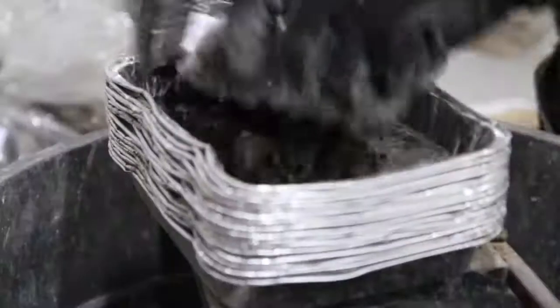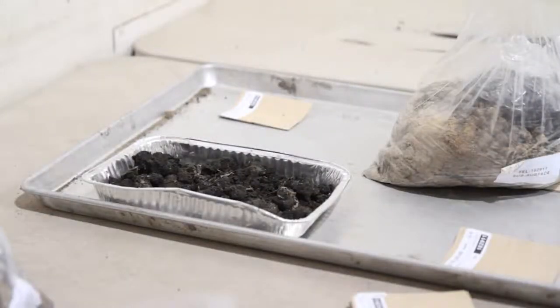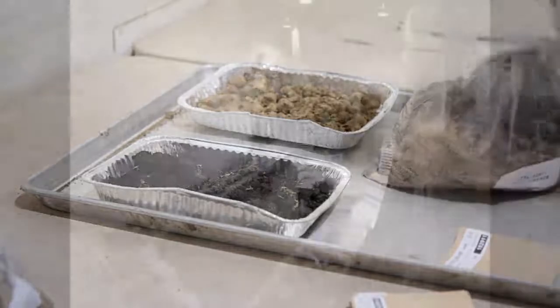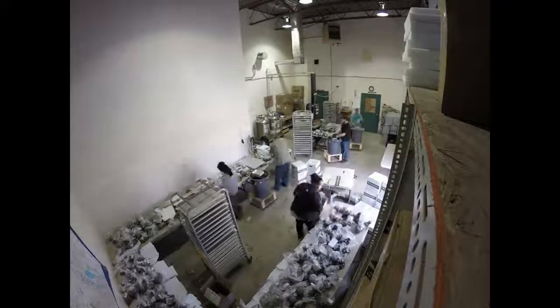Soil samples need to be unpacked from their sample bags, spread onto trays, and loaded onto drying carts in order for the samples to be dried before entering the lab. These carts are then placed in our drying room for 6 to 8 hours until the sample is dry enough to grind. The receiving process, including login and sample traying, takes 6 to 8 hours to complete 1,200 samples.